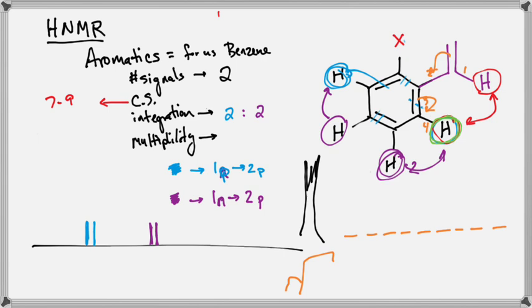The instrument is a large enough magnet that we're starting to be able to resolve it. Okay? So a large magnet would allow you to see those individual peaks, and that's kind of neat and cool because it's allowing you better resolution behind that. Okay? You're seeing the effects of hydrogens that are further away than you would normally anticipate.